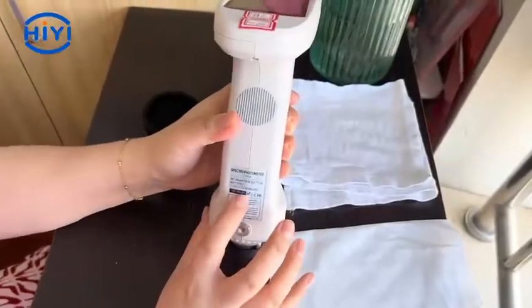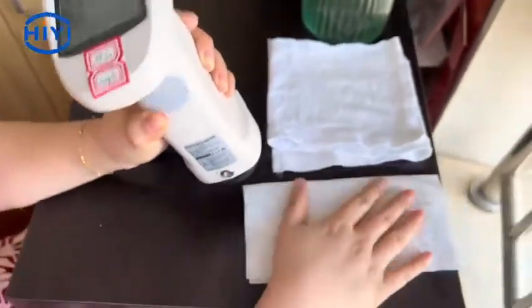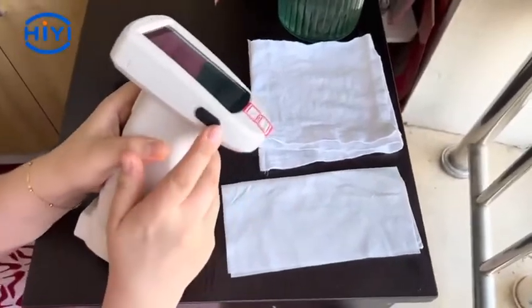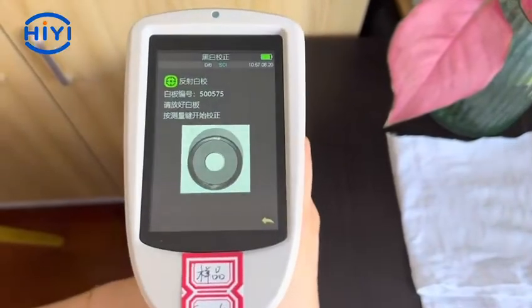Today I will use the DS7700 to test two pieces of clothes. Now let's open the power button. Before we test, we need to do the calibration.